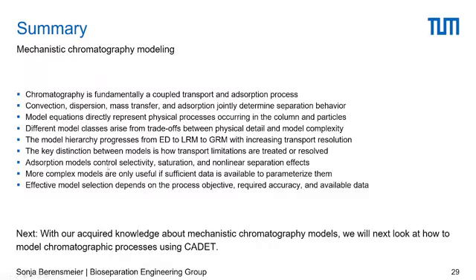And then when talking about adsorption models, these models are important for the selectivity, the saturation, and the separation effects that are actually happening. So your model will not work without adsorption models. And then lastly, more complex models are only really useful if we have enough data to parameterize them, right? As I said, the general rate model takes into account every little step of the way of the separation. If you have no way or no experimental data to determine all these parameters that you need, then this model will never be able to represent your chromatography process successfully.